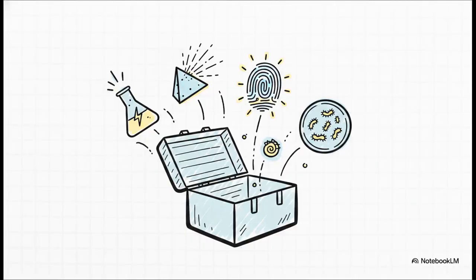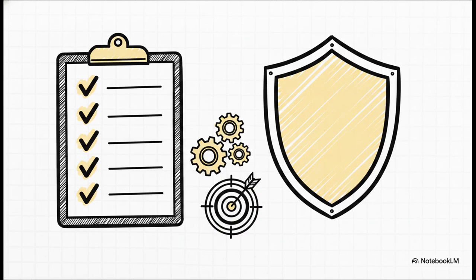But beyond those two, you've got a whole analytical toolkit to play with. Conductivity is fantastic for ionic residues, especially when you're looking for cleaning agents in rinse samples. Then you've got UV-vis spectroscopy and FTIR spectroscopy, which acts almost like a molecular fingerprint identifier for unknown residues or cleaning agents. And of course, we absolutely cannot forget microbial and endotoxin testing for bioburden control. Every single tool has a very specific job, and selecting the right one is what really drives your overall validation rigor.